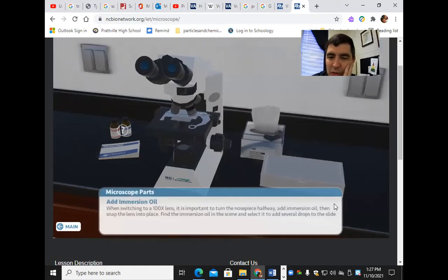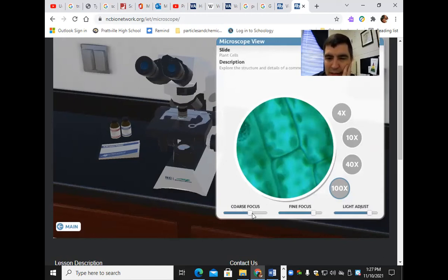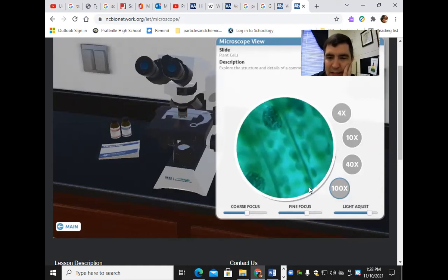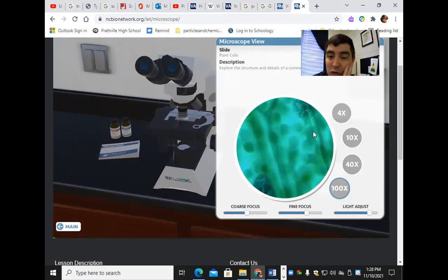Then I can click on 100x, and in order to do that you've got to add some oil. I clicked on the oil and now it's giving me what it looks like at 100x, which is a thousand times magnification. I can add or take away light and move it around. You can see those chloroplasts — those are what make the plant green. They have chlorophyll.